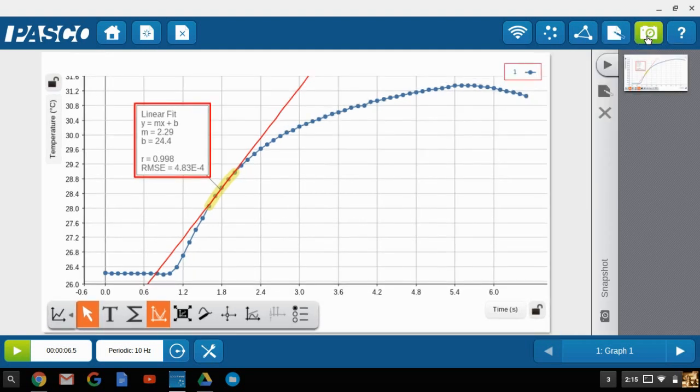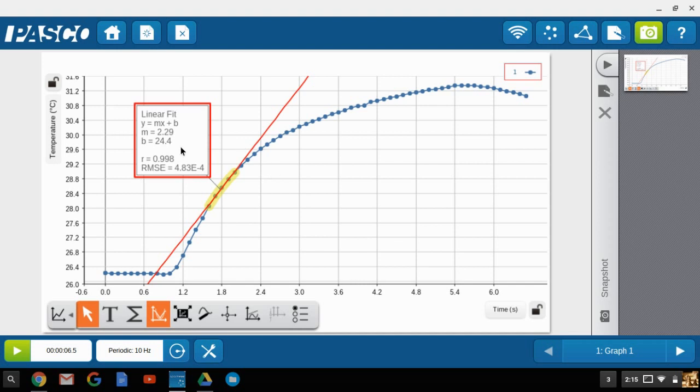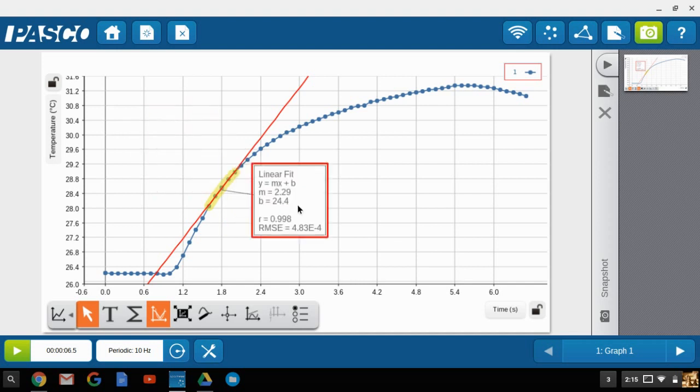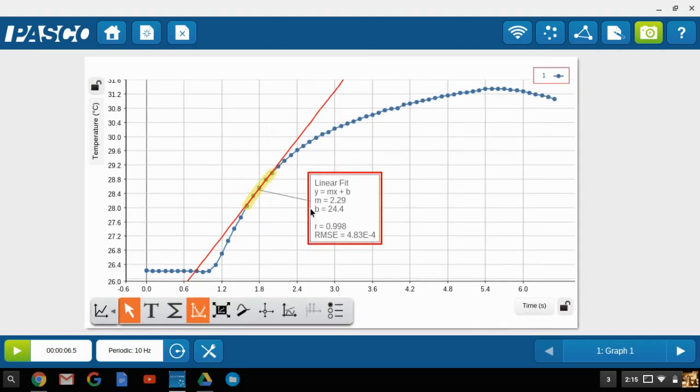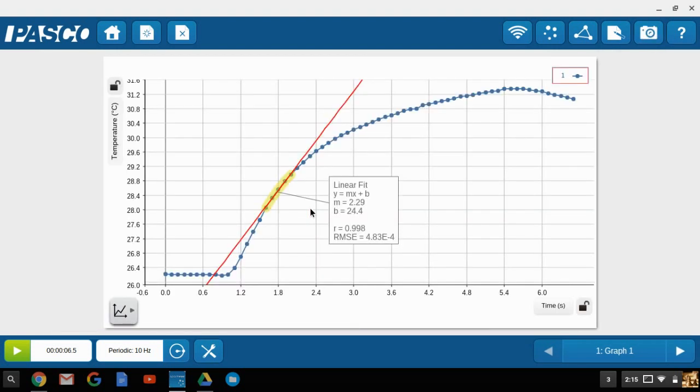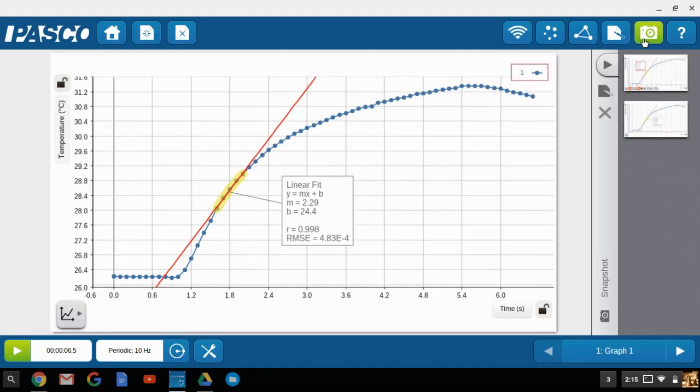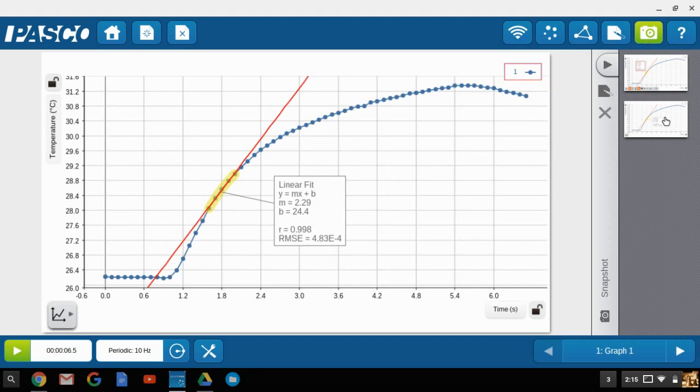Once that snapshot is taken, the pages of the journal are shown to the right-hand side. So if you want to capture another image of the graph, you can rearrange the analysis on that graph, and then again click on the snapshot icon. So you can see that the second journal page is displayed down below.